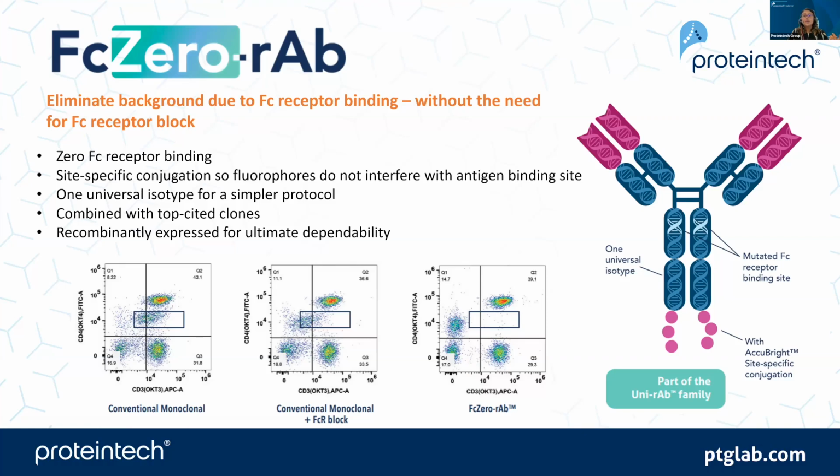You can see that really well here in this data where we're looking at CD3 and CD4 expression. Without Fc receptor block, you see the CD3 and CD4 populations, but slightly below, you also see cells that are a little bit lower in level for CD3 and CD4. This is the background from the Fc receptor binding.